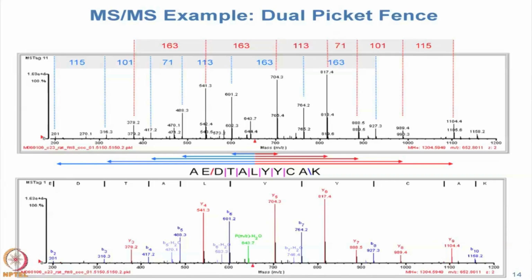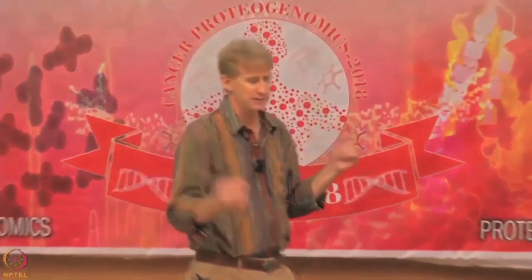Once you have 2 ions that are on the opposite side of the precursor mass, symmetric, they cannot be the same ion type. They must be complementary. So if you then start to do math or subtraction to figure out the mass gaps between them, you don't need to do math on ones that are symmetric to each other.